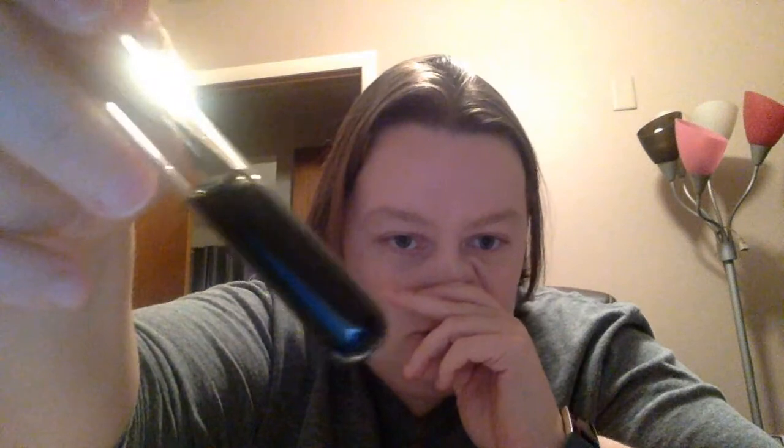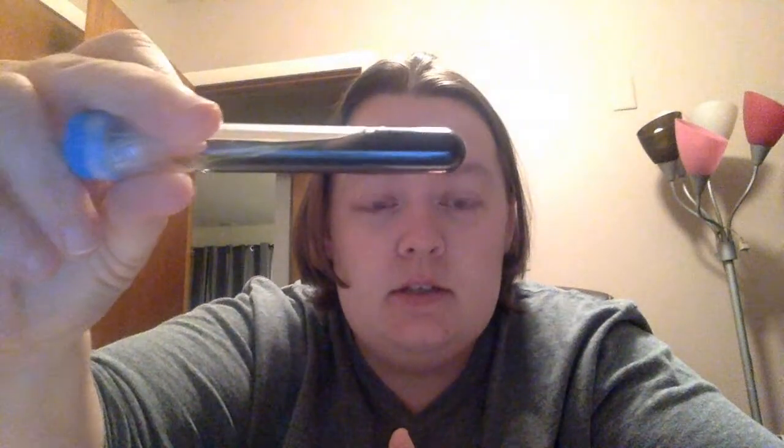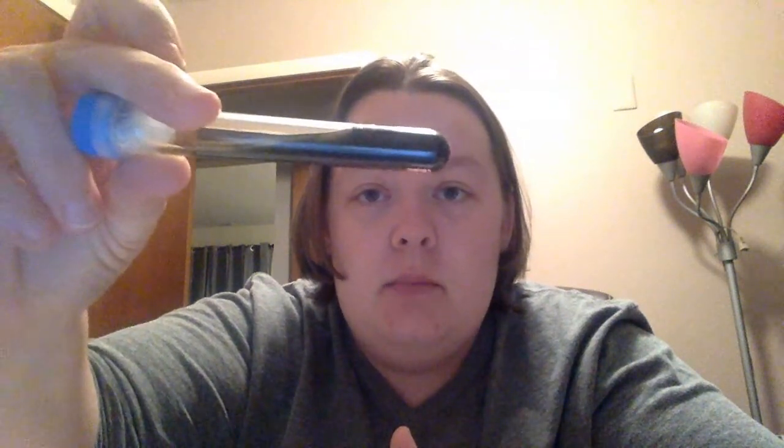Question 1 asks, can there be ruffinotoxin, which is a red chemical, in this effluent, even though it looks greenish brown? Again, this is greenish brown. It's not red. I know it's hard to see here, but it is greenish brown. Could there actually be ruffinotoxin, which is red, in here?